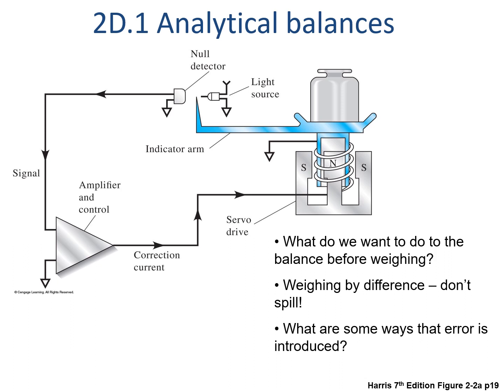There are several ways that you can take an accurate measurement. You may tare with a container so that the only mass that's recorded is the mass that's added. But this only works if you're going to take the measurement right away. So if you've got a beaker, you're going to measure into it right away. Otherwise, someone else might change the tare on the instrument, or the instrument might drift.